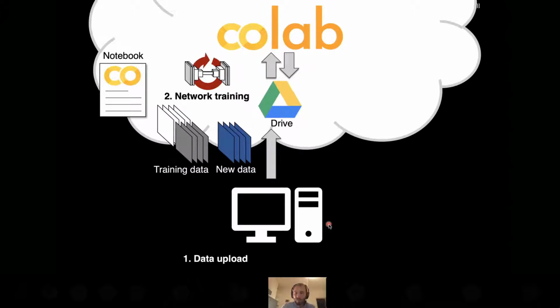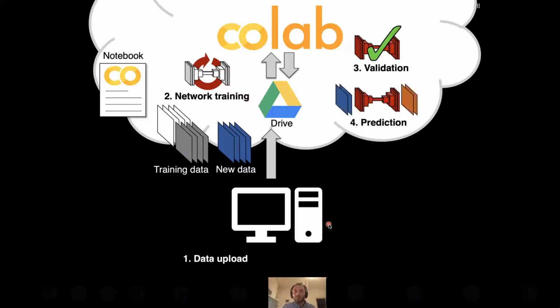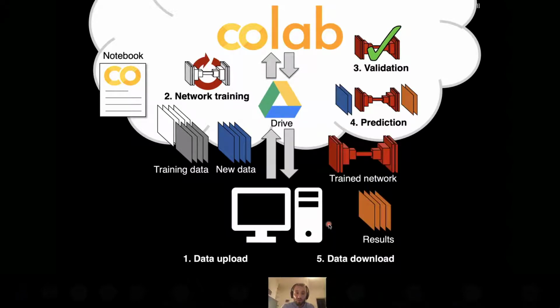So training as a first step, but also validation of the neural networks and the trained models, as well as running all the predictions necessary to then recover all the results from the new data as well as the trained model. And so you see that by being able to recapitulate the whole workflow of starting from data previously created by the user, performing training, validation, prediction, and then recovering the data, we've gone through the whole pipeline, the whole workflow of deep learning, to be able to exploit it as best as possible.